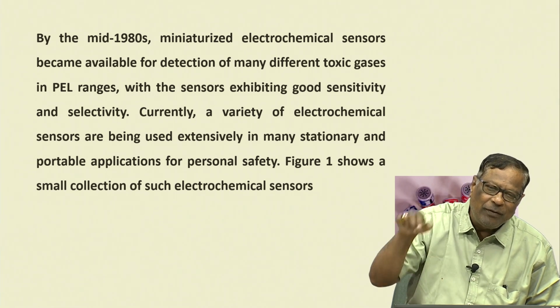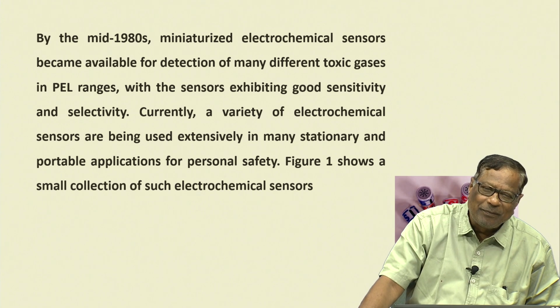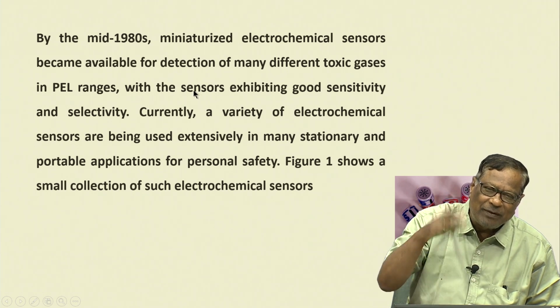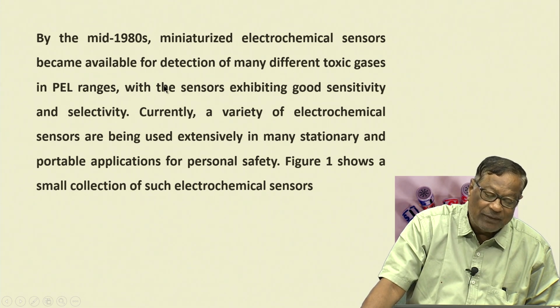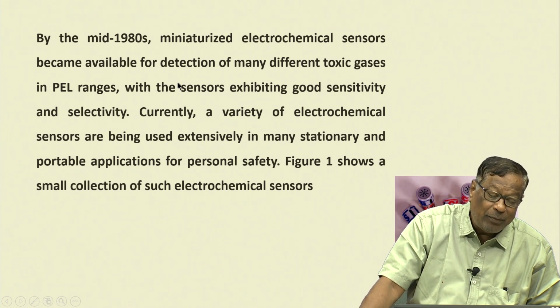So, switch it on when it goes to 20 kilometers. If you want to measure how much peroxyacyl nitrate is in the stratosphere, put simply, send a balloon there, switch it on, measure the altitude, and measure the sample, peroxyacyl nitrate. Like that, thousands of sensors for various chemical entities have been developed.